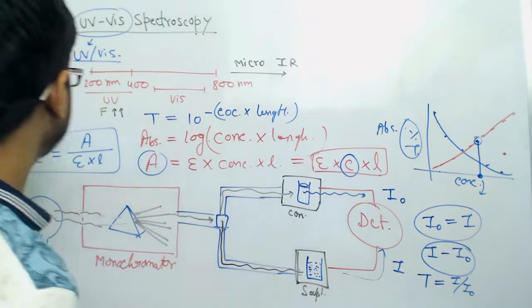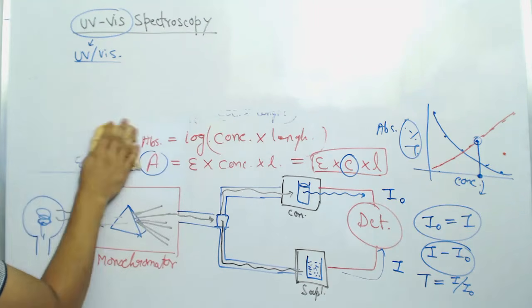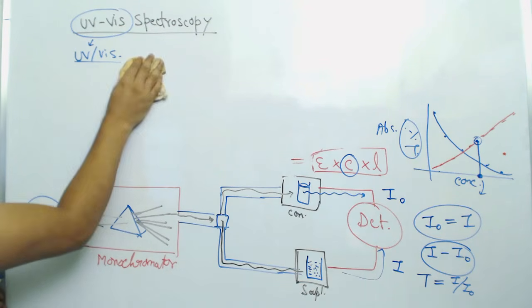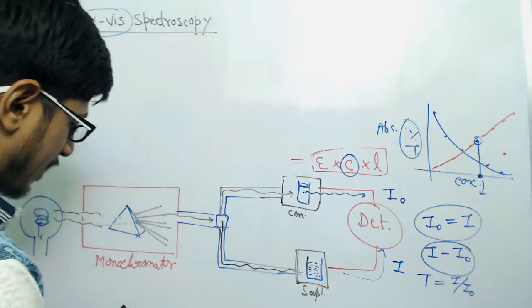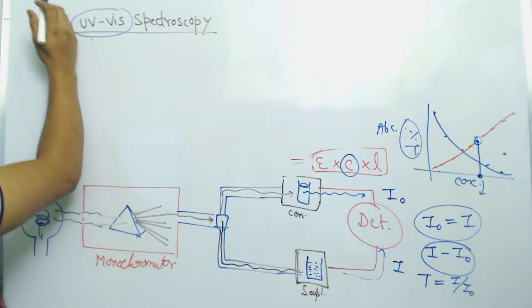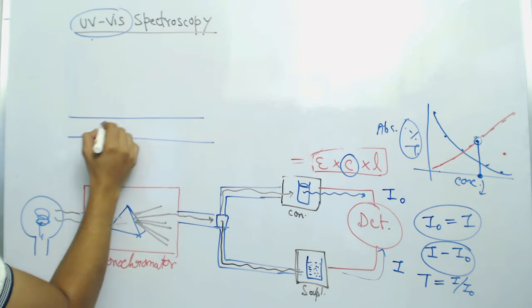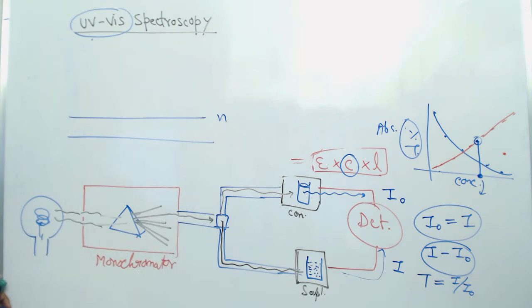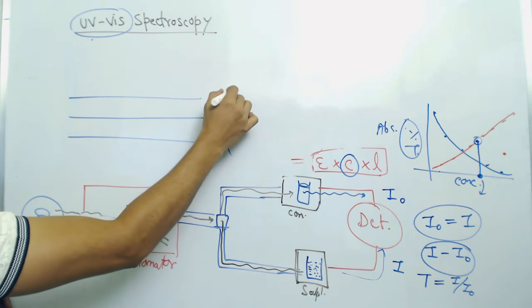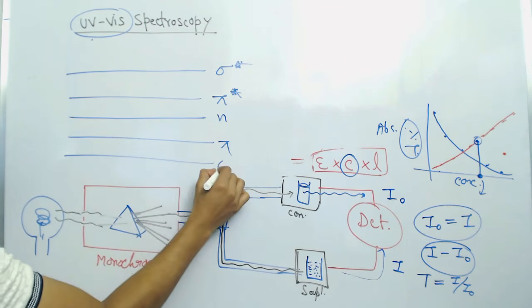To understand that, let me erase some of this. So what we know at this particular point is all the different molecules have chemical groups, different bondings inside. So for any molecule, we can simply divide it into energy states, with the ground states, like the non-bonding state or N, and then we have pi star, sigma star, sigma.